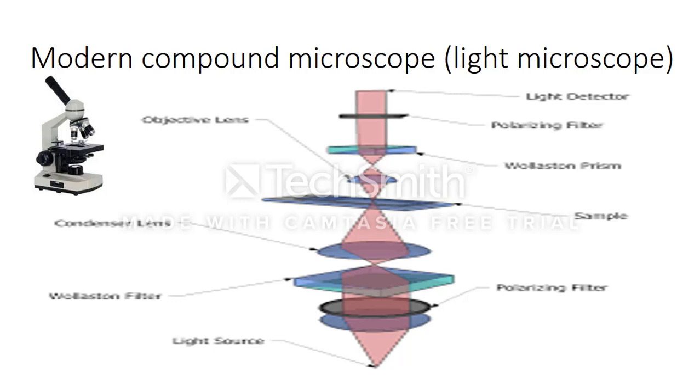So now let's consider this apparatus here is very good at amplifying, but let's consider a way to get higher resolution. Now I said wavelength and numerical aperture can have something to do with this resolution, but there are also different methods of messing with this level of resolution. And one of these is, as I said, wavelength. So let's look further into detail about that.